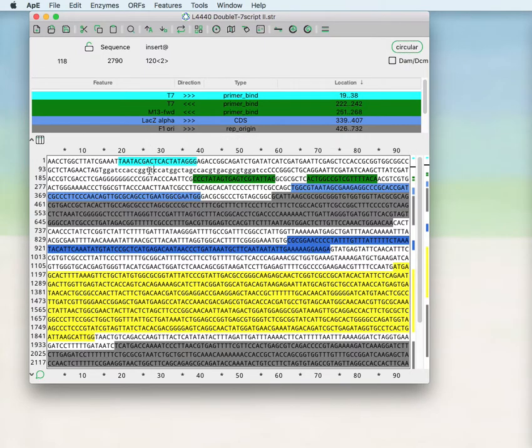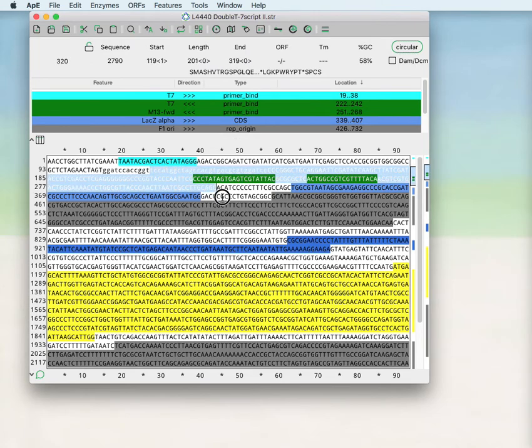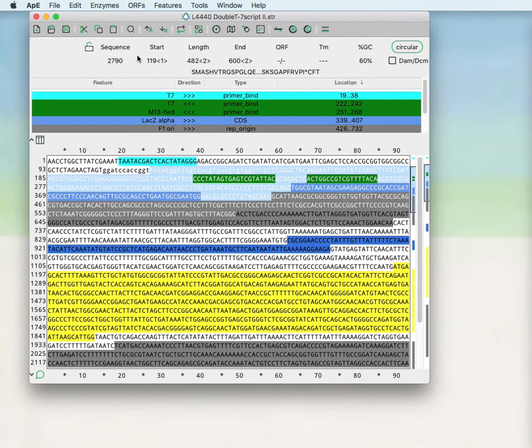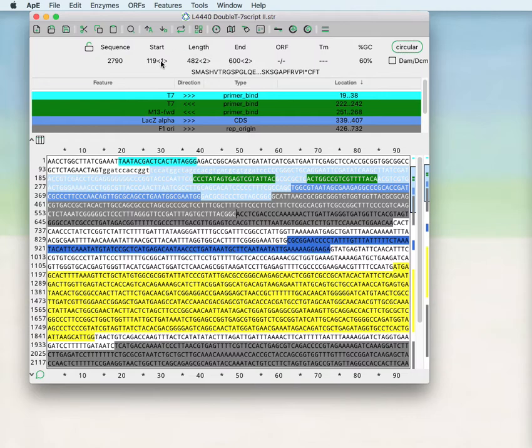If you select text, there will be a start position of the selected text, the length of the selected text, and the end position of the selected text. Then there is a modulo 3 of each of these numbers indicated with these less than and greater than signs.